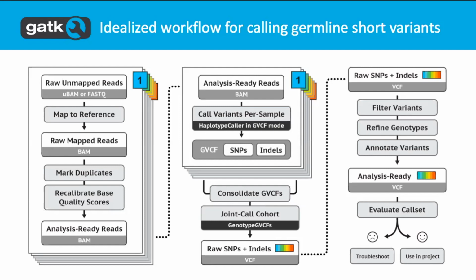In principle, it should be applicable as well. The thing is, we haven't done it yet, so we can't say. We haven't validated how well it works, because you have kind of different error modes, different problems to deal with in the somatic context, and so you could conceive that the approach would be applicable, but there you might need to have some tweaks. We just haven't done that work yet.